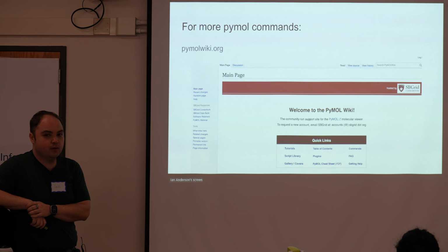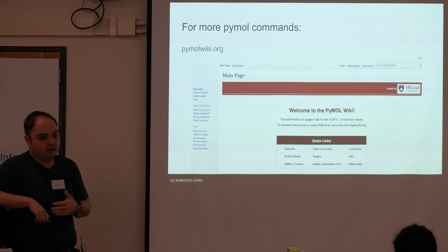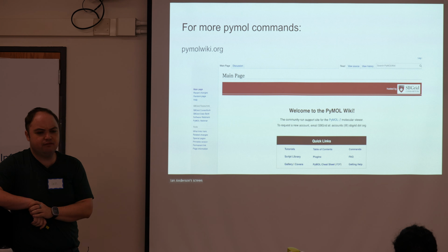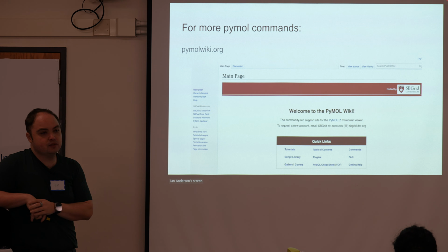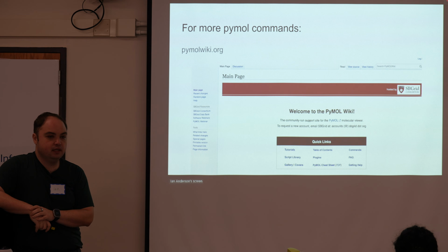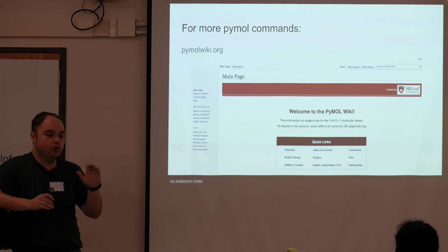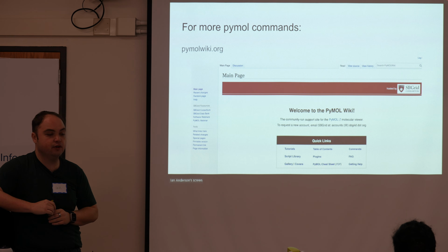The one thing that I would recommend that I think is not obvious in the wiki, that I find very nice, is the ray trace settings. You don't actually need the fancy graphics card with ray tracing. Any computer can do it. It will just be a little bit slower. But ray tracing is PyMOL's way of ensuring that everything has really nice borders and everything has light reflect on it in a way that makes it look very appealing.